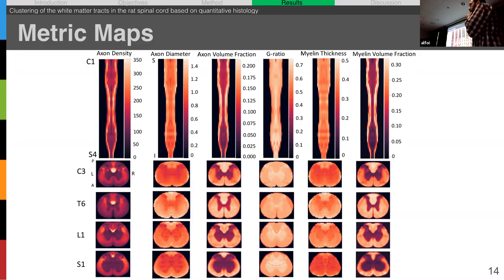Is it possible to interpret this in terms of we know we're not getting small axons? So is the corticospinal tract characterized by particularly small axons? Small axons pop up on your segmentations, but you really cannot identify them, so they don't show up in the diameter. Yeah. With a lot of osmium there, you can't really tease it out. So you end up with something that's bright on this density, but yet you cannot see it in the diameter.